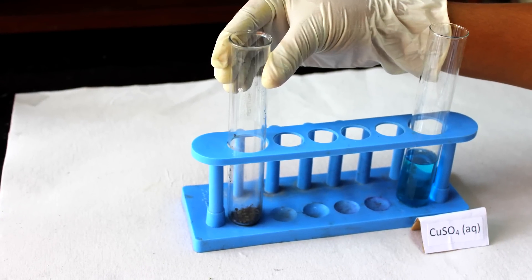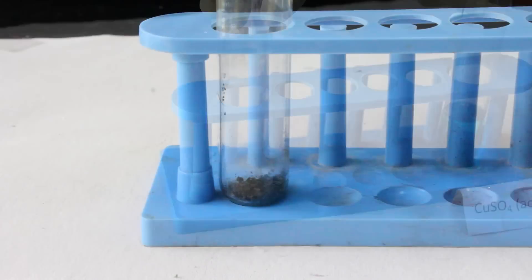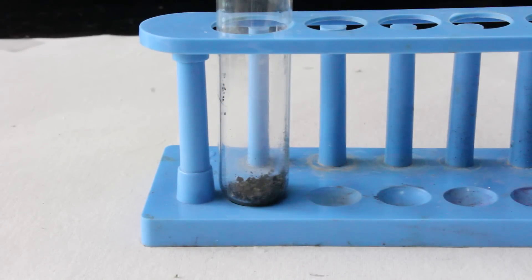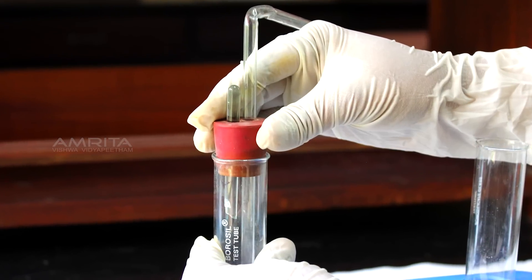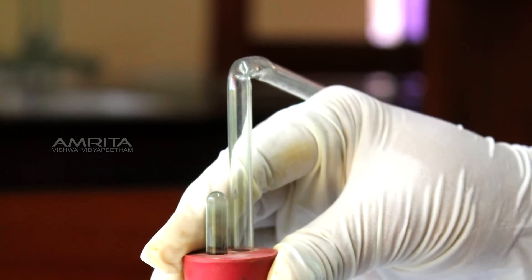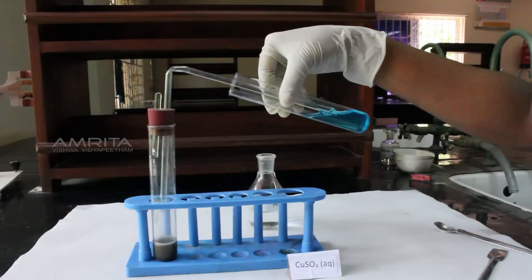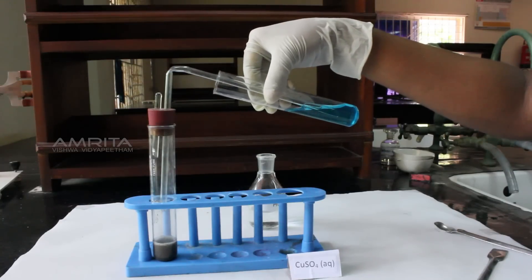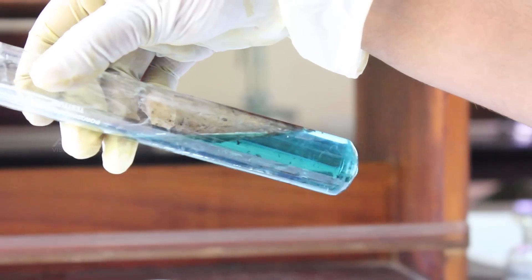Similarly, transfer a small quantity of compound to a boiling tube and add a small quantity of dilute HCl into it. A gas evolves in the boiling tube. Now, cork the boiling tube which has a bent tube connected to it. Insert the other end of the bent tube to copper sulphate solution.